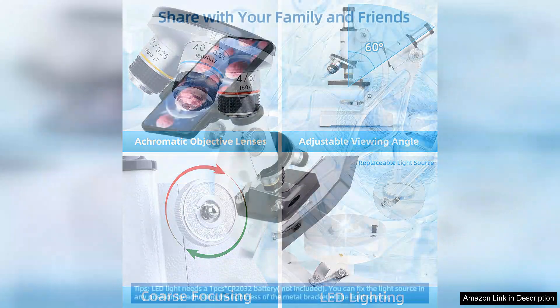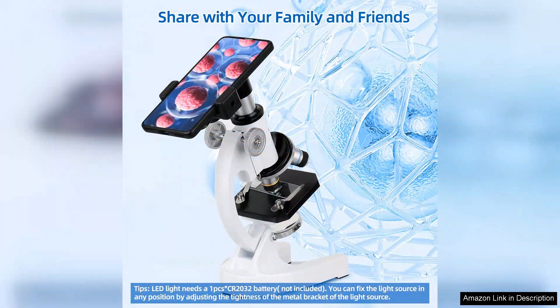Additionally, the mobile phone adapter is a modern touch, enabling children to capture and share their observations easily. This feature not only enhances the learning experience, but also encourages creativity as kids can document their discoveries.